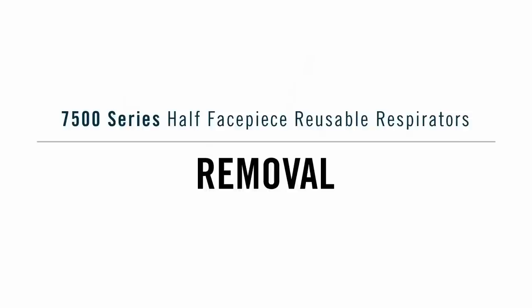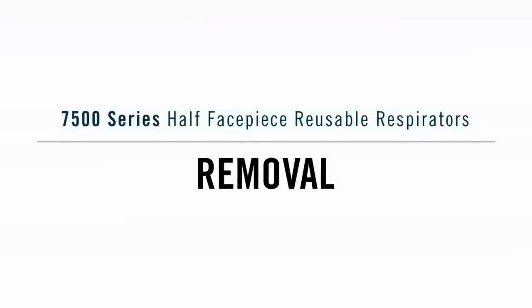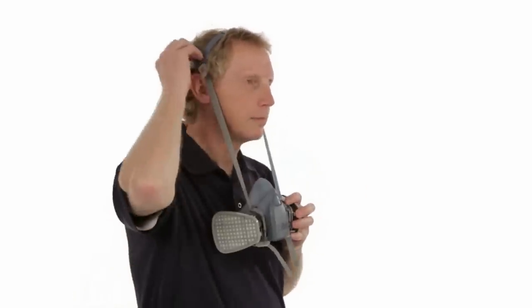To remove the respirator in standard mode, unhook the lower straps using both hands and pull the head harness over your head. To remove the respirator in drop-down mode, unhook the lower straps using both hands, then slide the face piece down the straps to your chest.